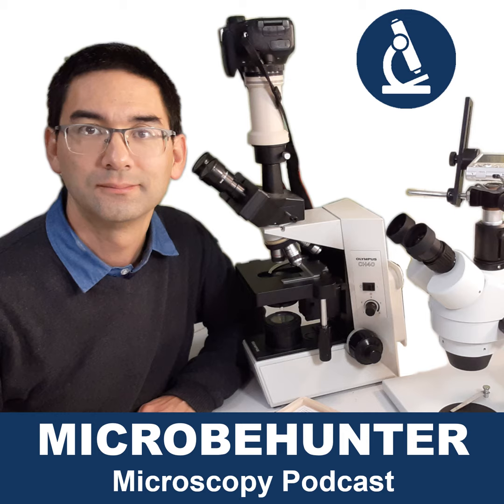So I think I'm getting a little bit sidetracked now. I just wanted to show you that if you want to work with very high magnifications, this only works with specific objectives, okay? And that there are some disadvantages with that. However, I would say in most cases it's not needed, and larger bacteria, especially bacteria that you can also find in water samples and so on, can be seen quite well with a total magnification of 400 times. Okay, there are other parameters that reduce the visibility, like lack of contrast and so on, but it's not really magnification.